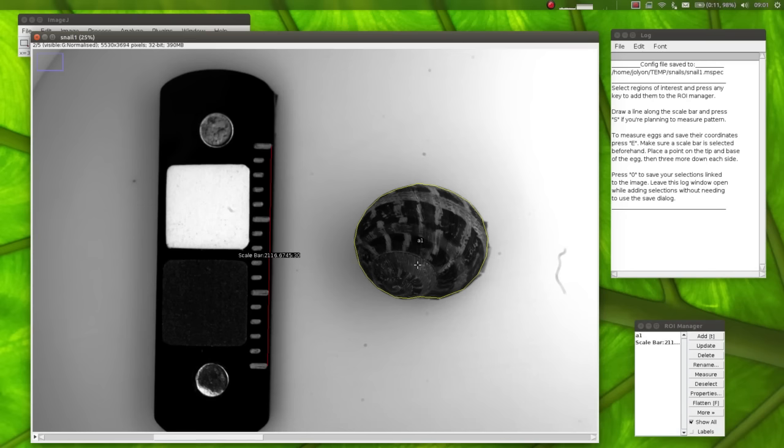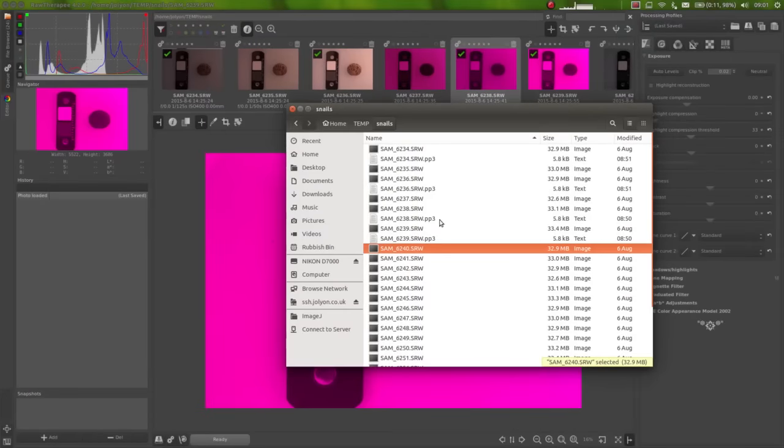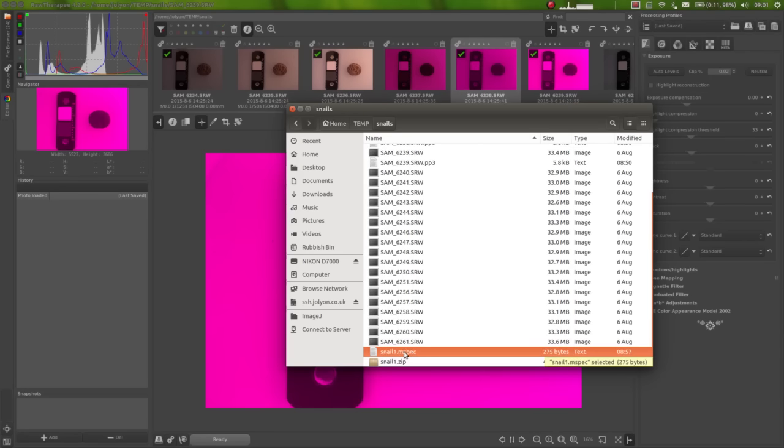Once you're happy with the regions you've selected and scale bar you've selected, just press 0 on your keyboard. And you'll see in the log here it says ROI saved. And if we look back at the directory containing our images, it's created this zip. So this zip file contains the selections we just made. And this mspec file is the multispectral image file that links with the raw images.